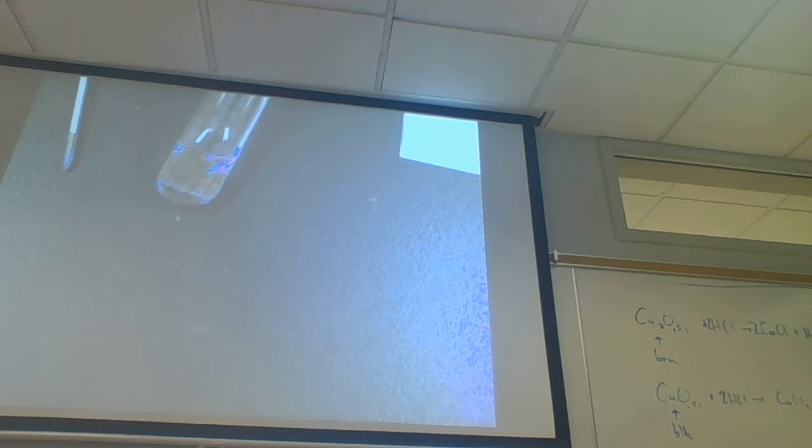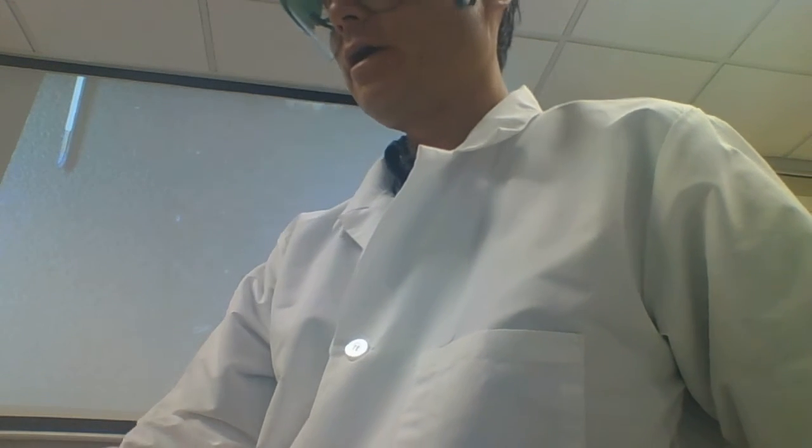Do you see the black precipitate forming on the surface of the copper? What do you think that black precipitate is? Silver. Silver metal. Tiny crystals of silver metal. There's a black coating on there. It's kind of forming like a little fur of precipitate. As the crystals grow bigger, they're not going to look black, but more gray. And they're going to give us a silver color.